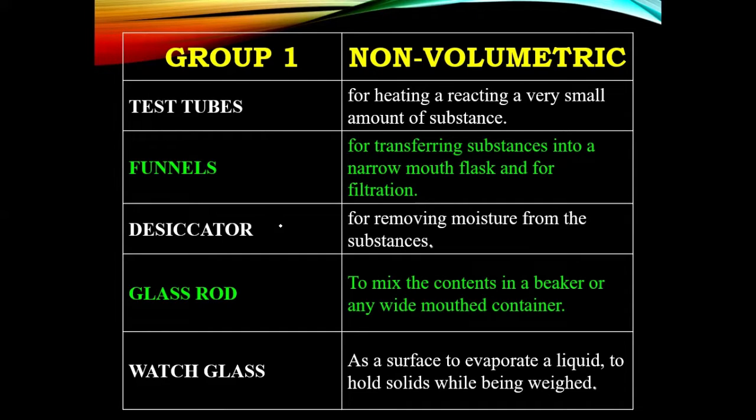Desiccator has no use in our O-level, A-level, or intermediate or matric because desiccators are used for removing moisture from the substances. So ignore it for your syllabus. Glass rod, to mix the content in a beaker or any wide mouth container.